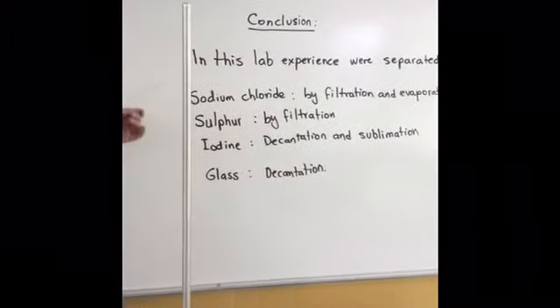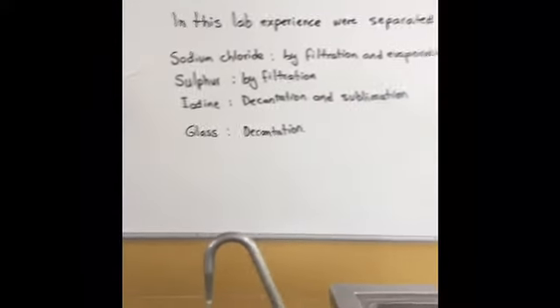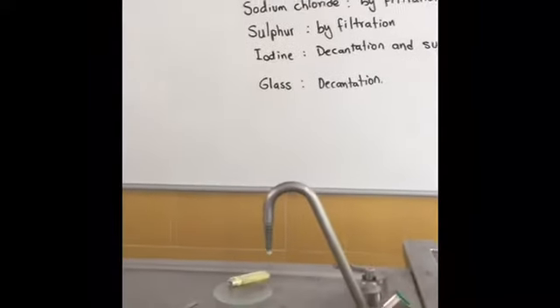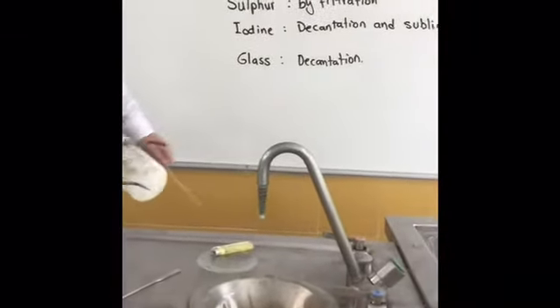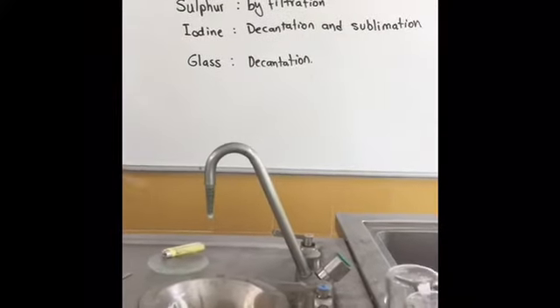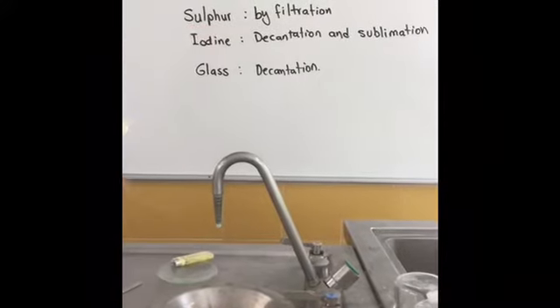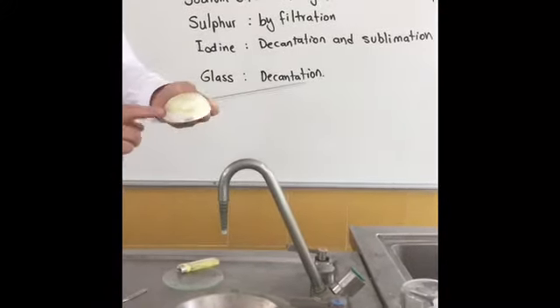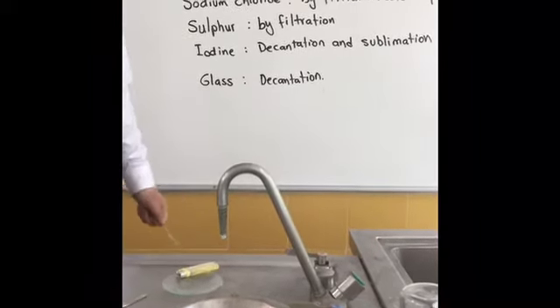In conclusion, in this lab experience, we have separated sodium chloride, the substance, by filtration and evaporation. Sulfur was separated by filtration only. Iodine was separated by sublimation. And glass by decantation.